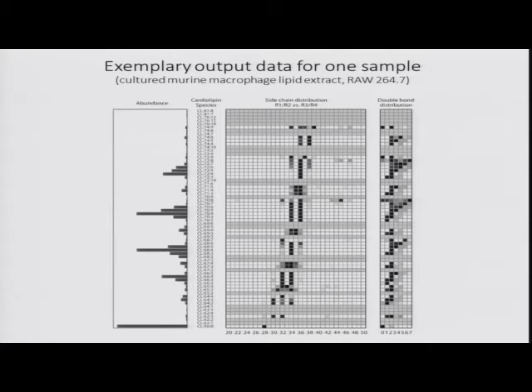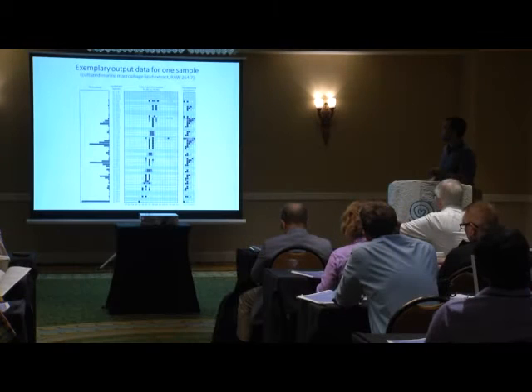species. What we typically see in a normal sample is that the composition of side chains is very symmetrical, as is also already reported. So we have the highest possible symmetry in the substitution of these cardiolipin species under normal conditions, especially for the length of the carbon atoms. For the number of double bonds, so how they are distributed, the variability is larger, so there is more asymmetry in these species, especially when there are more double bonds present.